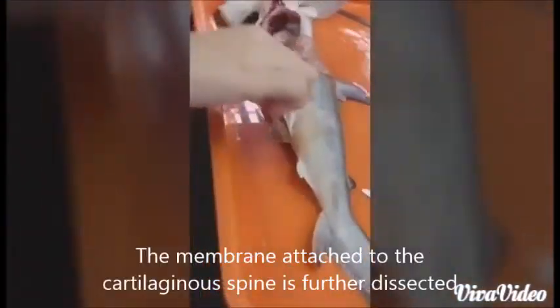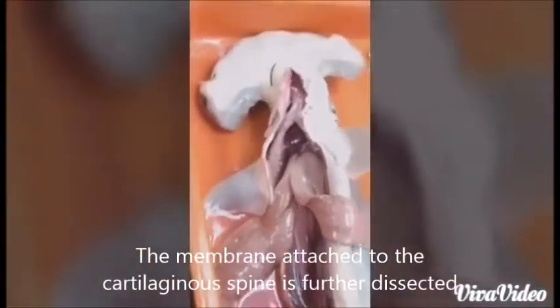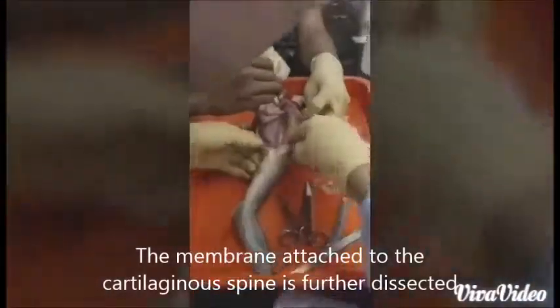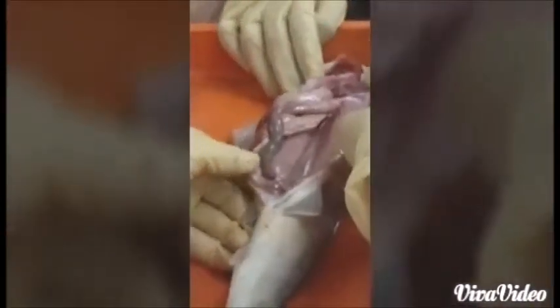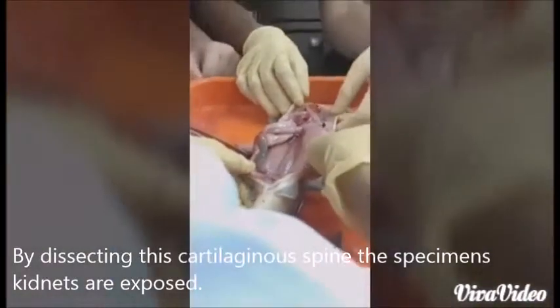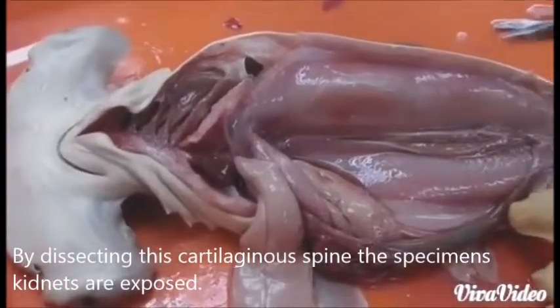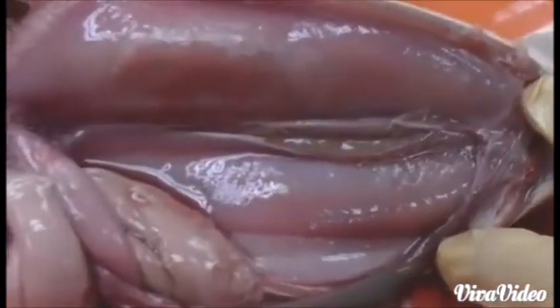The membrane attached to the cartilaginous spine is also further dissected. By dissecting this cartilaginous spine, the specimen's kidneys are exposed. As you can see, those are the kidneys.